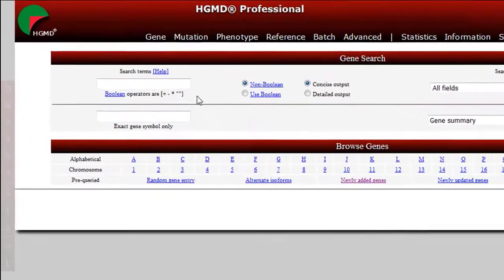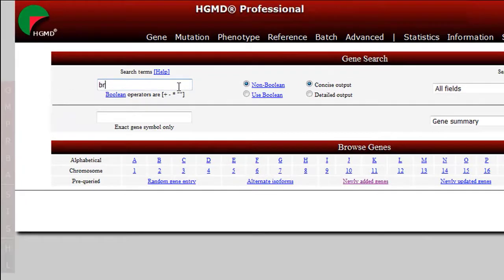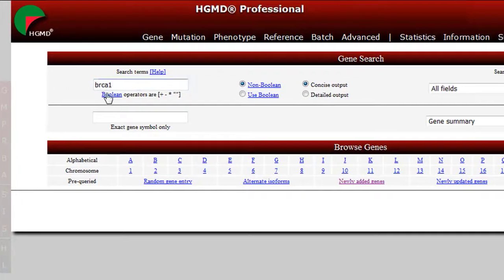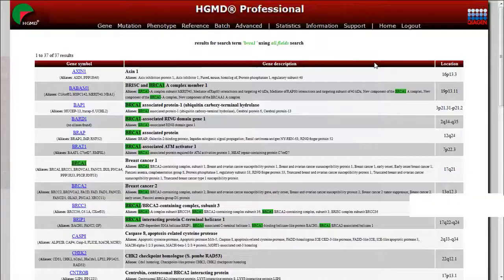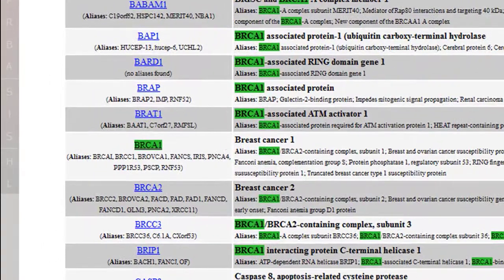Let's use BRCA1 as an example to search the database. Using BRCA1 as the search term, with the search option All Fields selected, returns all genes which contain the term BRCA1 in at least one field. To navigate to the desired gene summary report, click the hyperlinked name.